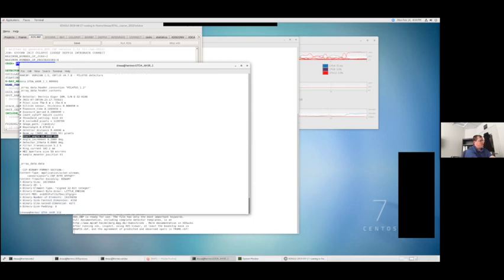The thing to remember is that not all beamlines have their headers set up to report that information. So if you're collecting data from any given beamline, as you're collecting the data, you want to make sure that you know what the beam center is for that beamline. They might tell you it's in the header, you don't have to worry about it, that's fine. But if it's not in the header, you want to make sure that you write it down so you can have an accurate guess of that.